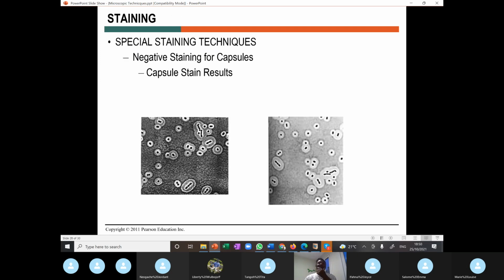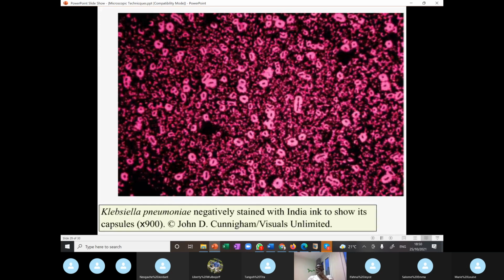And when we observe under the typical light microscope, you are going to see the internal structure of the cell stained with the positive stain. Crystal violet should be purple, and then you see this clear layer. This is a layer of the repelled negative stain. So you can now see that there's a capsule, this whitish area. You can now see the presence of a capsule around the organism. This is a clearer image. So you can see clearly the repulsive area, the presence of a capsule and the organism. This is what you see on the microscope.